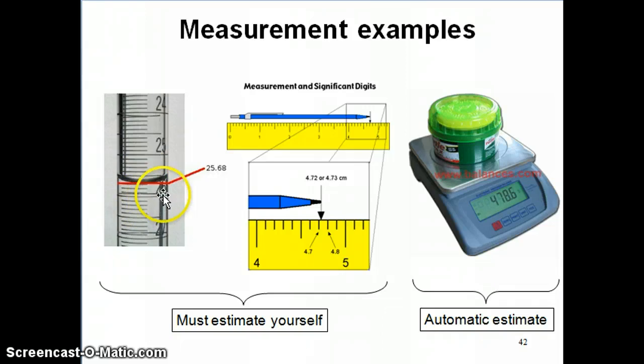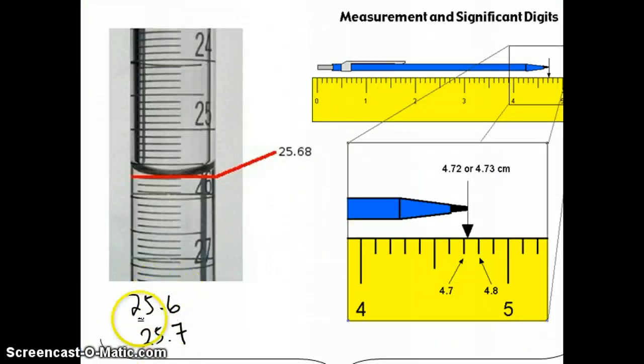Now, the meniscus, if you look carefully, it's a little bit hard maybe to look at this, but if you notice, it's between 25.6 and 25.7. It's very close to 25.7, but it's not quite 25.7. So, the meniscus, it's between 25.6 and 25.7. So, these two numbers right here, 25.6 and 25.7, is where the meniscus is. Now, I know it's between 25.6 and 25.7, because that's what the burette tells me. The burette gives me lines here, 25.6 and 25.7. So, the burette tells me that these meniscus is between those two numbers. In other words, these three digits right here, that's my certain digit.